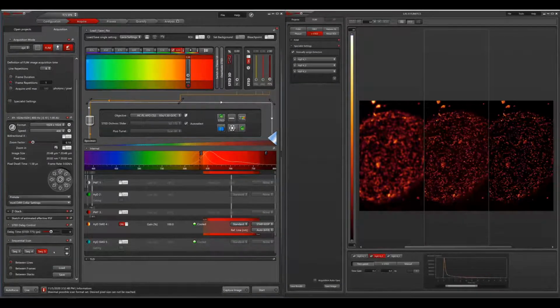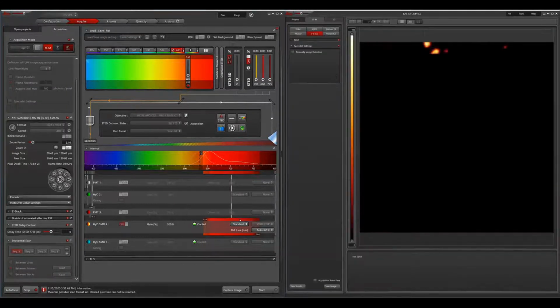And one last one. Sorry, I should have done this a different way, where I keep my settings as they are. So let's go back and just change the order. So here we just put 7, and here we put 2%. And the first one should stay at 0 for our confocal. I just want to make sure that I'm still in a good focus position here right now.